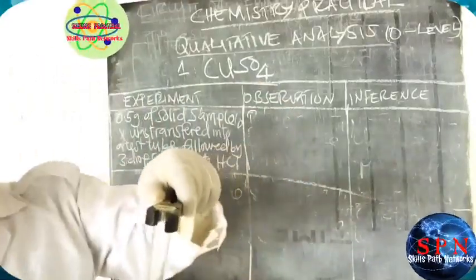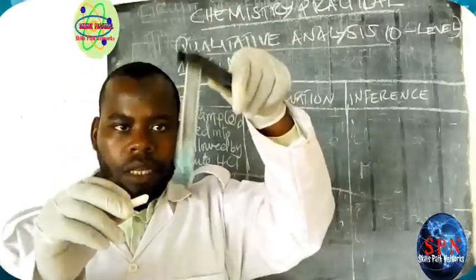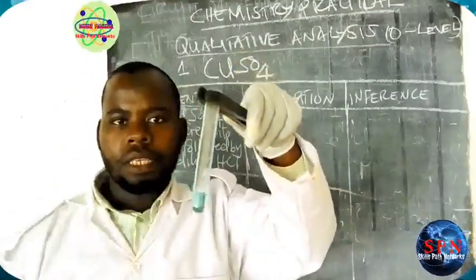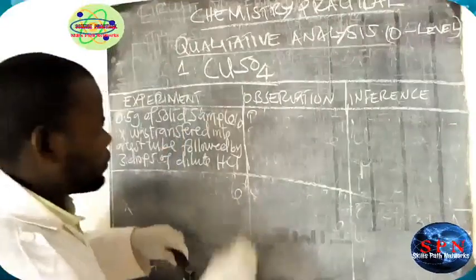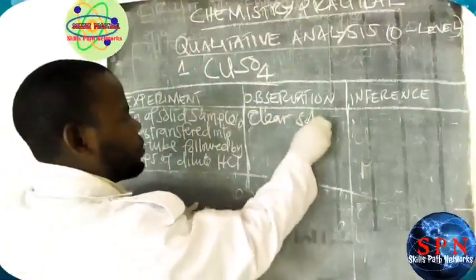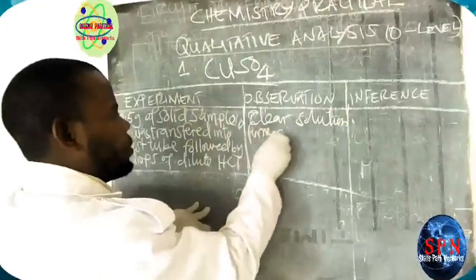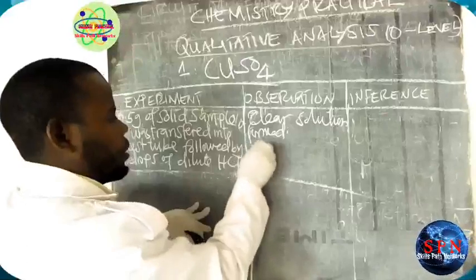So our observation is a clear solution formed and no gas evolved.